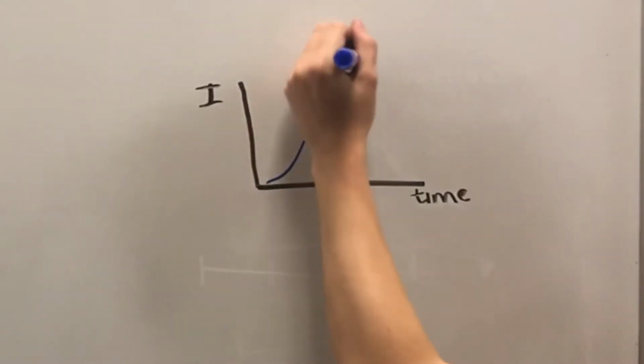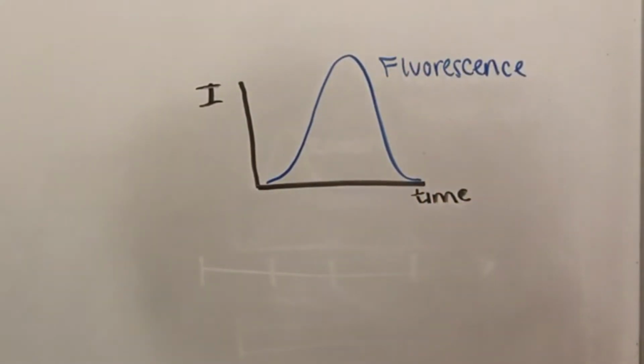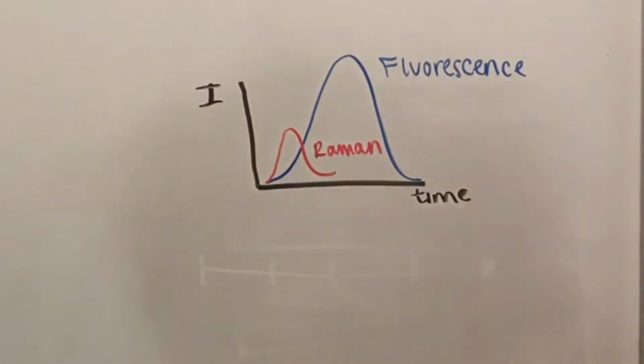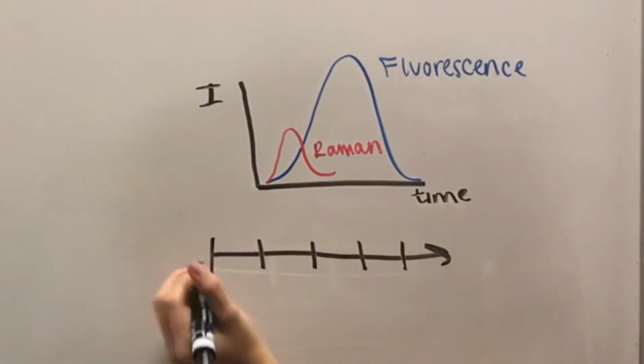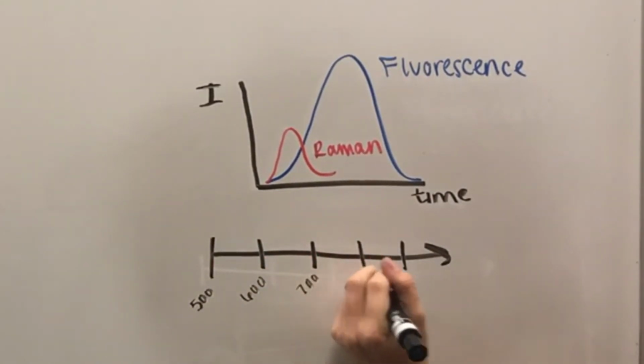Fluorescence is a similar process to Raman, though it requires an absorption and emittance step, rather than just the single step for Raman, and it occurs in similar experimental laser wavelengths. Fluorescence is often more intense than the Raman effect, masking desired features. Some techniques exist for reducing fluorescence, such as using near-infrared lasers.